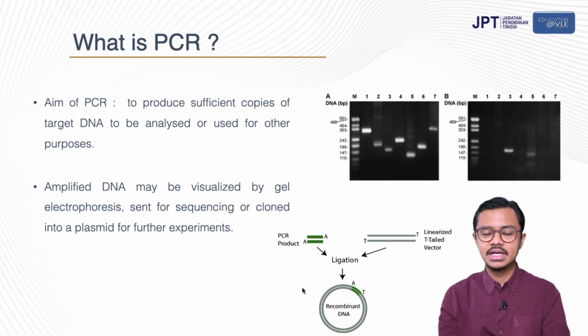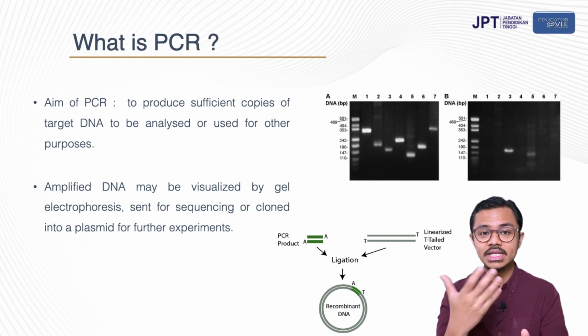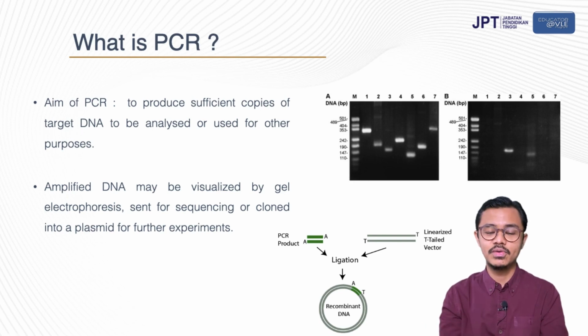This is another use, whereby these PCR copies, for a particular region, once it has been multiplied, can be used for cloning purposes.